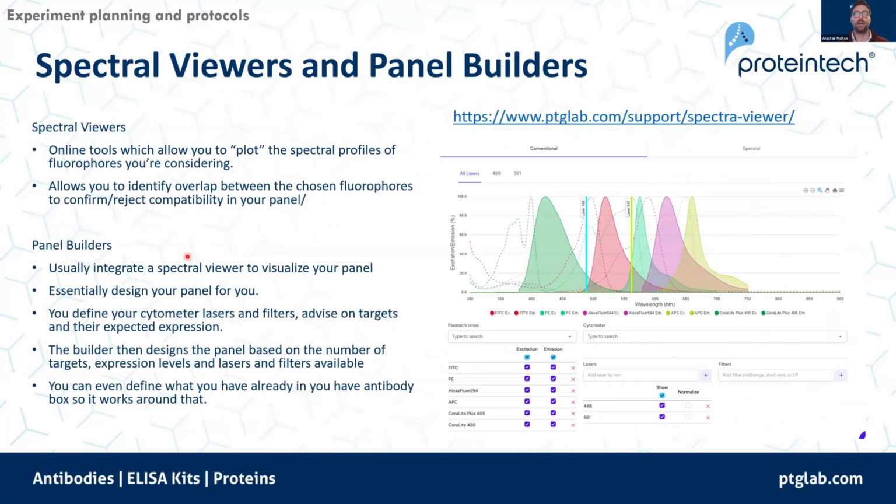When you're trying to build panels of antibodies, particularly larger panels, it's really crucial that you understand the spectral profiles of those fluorophores. So the place to start is always going to be using either a spectral viewer or a panel builder. A spectral viewer is an online tool which allows you to plot the spectral profiles of your fluorophores against each other so you can see where there's potential spillover.